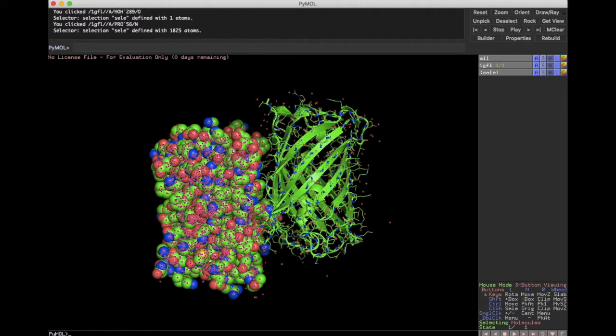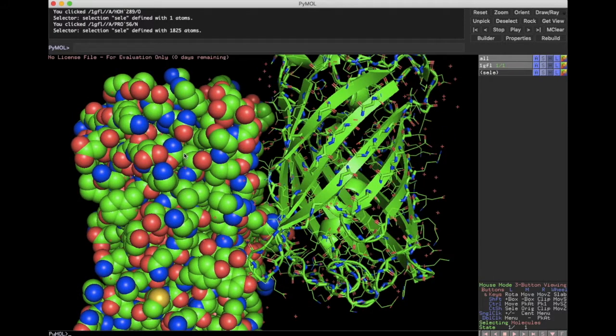spheres. So again, the spheres are simply an estimated outside border of the atoms, right? So there's the electron orbitals, which are around the nucleus, and those orbitals go out a certain distance, and these spheres represent kind of how far out that electron cloud will go, and represents kind of the outside of those atoms, right?